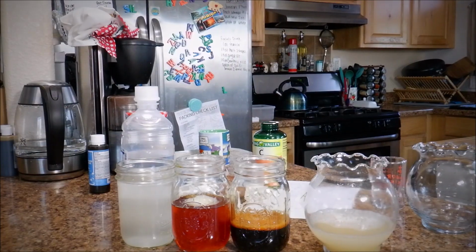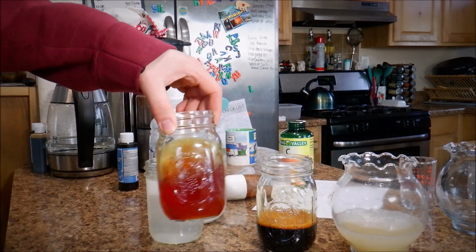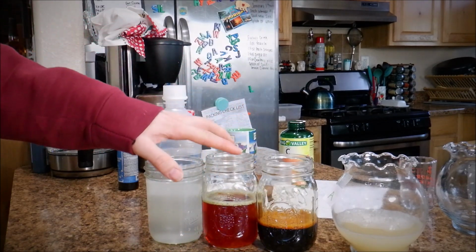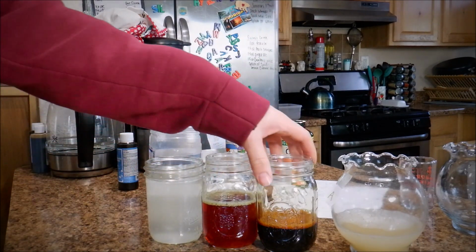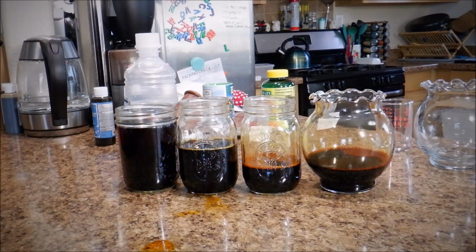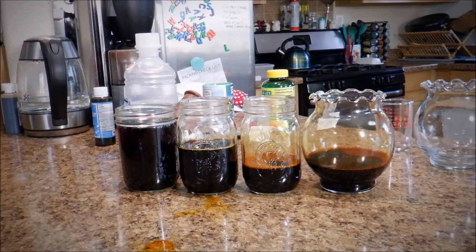Cool. After a few minutes, you can see that our second trial is actually now changing too, which goes to show that different concentrations can react at different speeds too. So this was obviously an extremely low concentration of iodine, a little bit higher concentration, and then the most concentration we had here. Well, lo and behold, the first solution did end up changing. I'm not 100% sure on when because I wasn't paying attention. So yeah, it did. So definitely different concentrations can change at different rates.